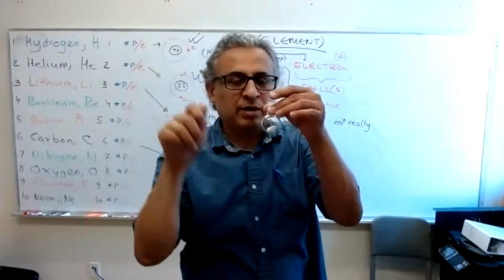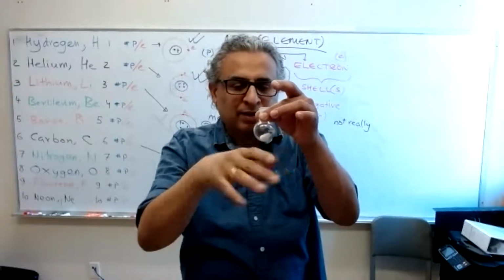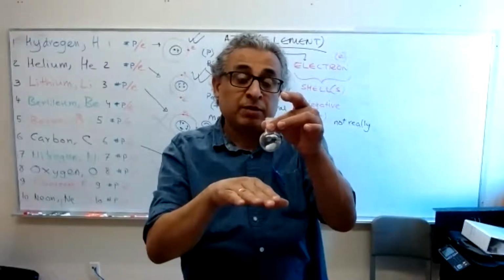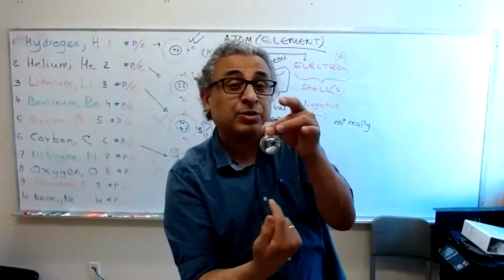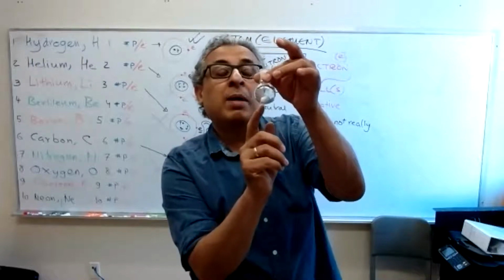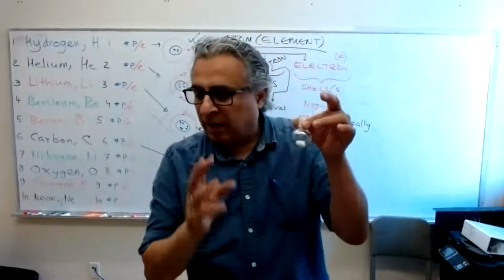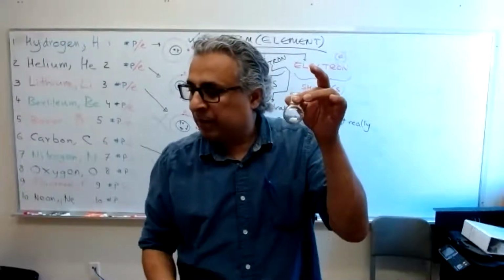Once you plug it in and attach it on top of that little square box, it can either heat up the top surface, or when you stir, there is a magnetic disc underneath that you cannot see that starts to turn. As it turns by magnetic induction, it also starts to turn this. It starts to spin.